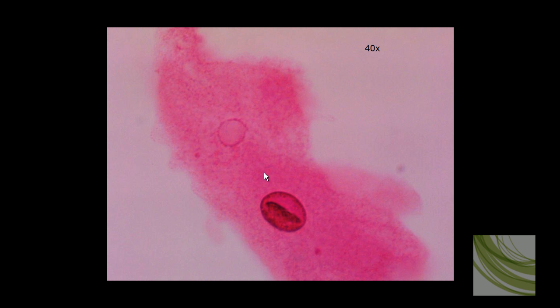If you didn't have a way of getting rid of that fluid, you could actually explode this cell or this animal. That's where the contractile vacuole comes into play. The contractile vacuole fills up with water in a stage we call diastole, then the contractile vacuole contracts, expelling excess water back out into the environment in a stage we call systole.